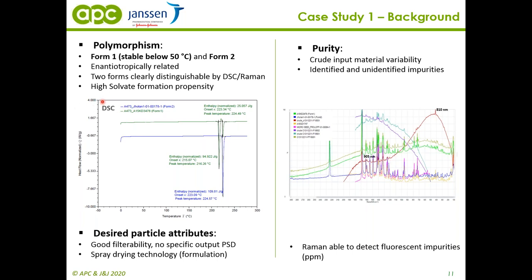We also had an indication that it has a high solvate formation propensity. And in terms of particle attributes, there was no specific requirement for output particle size distribution, only that it filters well. This is because there was a spray drying technology in the formulation.